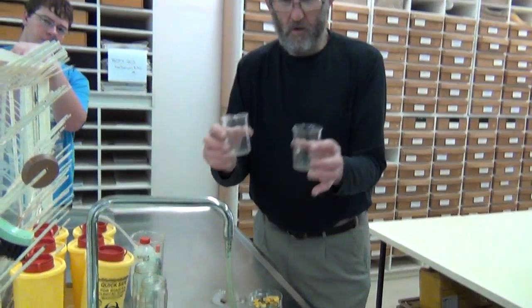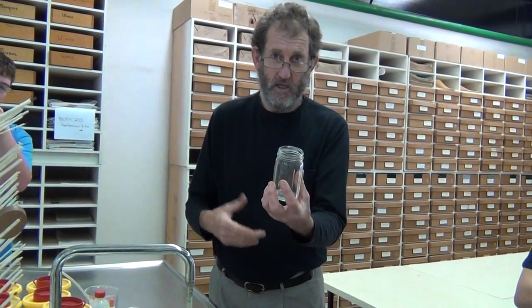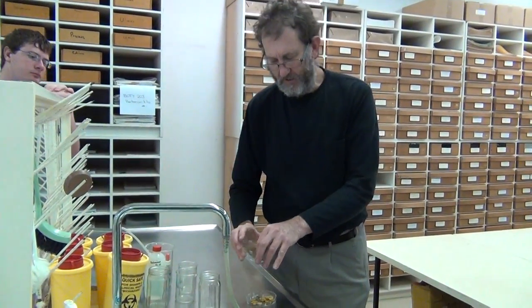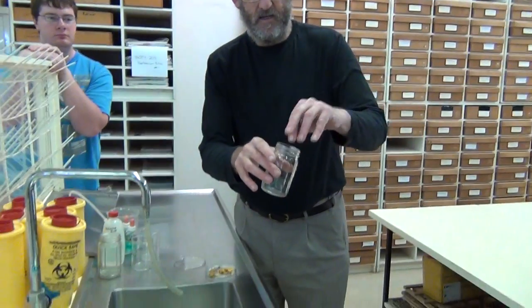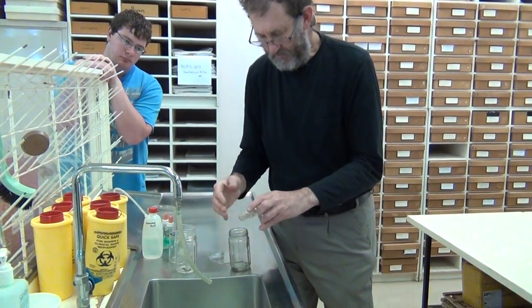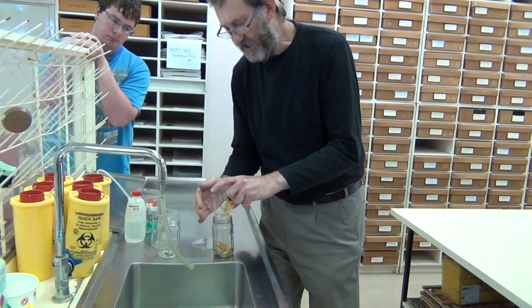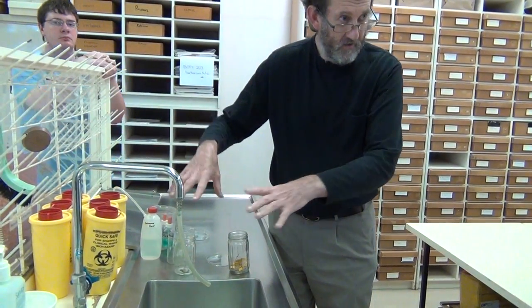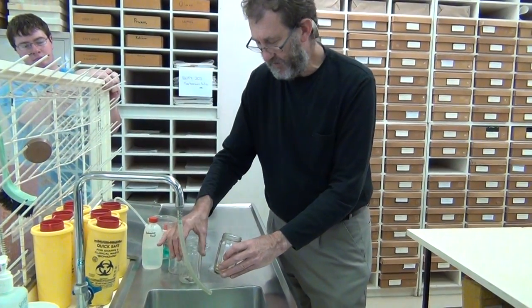In a laboratory we might use beakers. At home, any jar of reasonable quality that will sustain hot water is fine. The easiest thing is to put the specimen into — even drop it head first into — the jar. Those of you in the lab can use beakers or jars; it doesn't really matter.